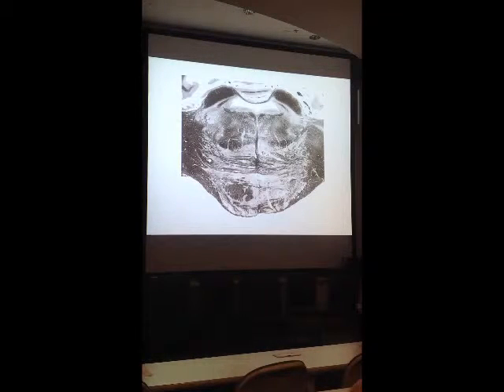Now, you ought to be able to recognize that this part of the brainstem is dramatically different from what we've been looking at. Again, it's very big. My eyes are attracted to all these decussating fibers. This is slide 19, by the way, and it's upper pons. You should be able to know that it's pons because you see all these pontocerebellar fibers that are very typical of pons.